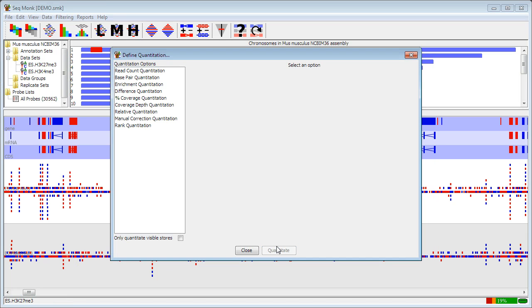So having decided where I'm going to make my measurements, I now need to actually use my data to provide a measurement for every promoter in my genome for every data set that I have. Again, there are a number of different ways you can do this and the options are listed down the left hand side of the quantitation options.